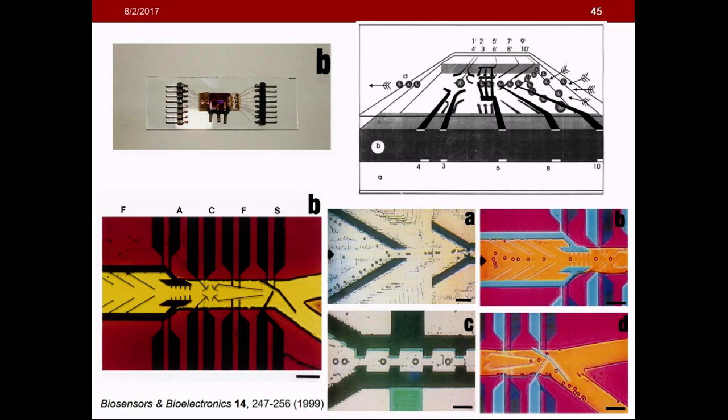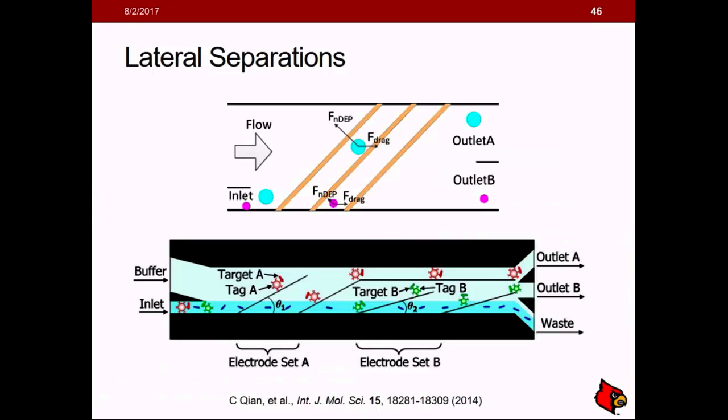So we have electrodes on the top and bottom, which is illustrated here, of particles that would come in, be focused, analyzed, and then depending on the behavior would be sorted one way or the other. So with respect to sorting, if you have continuous flow, the particles can come in and then maybe larger particles go one way, other particles go another way.